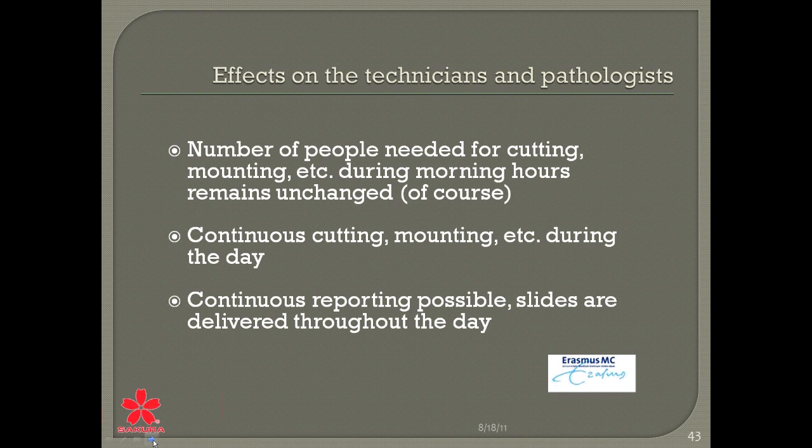And did it have a lot of effects on the technicians and the pathologists? Well, the number of people needed for cutting, mounting, and staining was unchanged. Of course, this is true because you have the same amount of work that you're used to. The only difference is you're now doing it during the day, and not only in the morning where you were rushing, and you came in and already had 700 blocks this morning, so you had to finish them, and then you need to push to get it off.